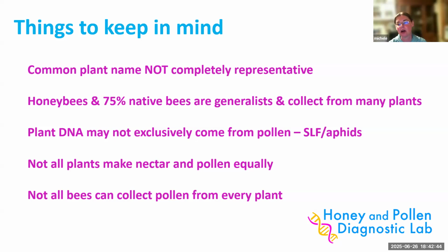If the pollen occurs in pockets in that extracted honey and is distributed throughout a large volume, it's basically going to get diluted down. That's why I usually ask for 2 tubes of extracted honey, because we know there's less pollen in it.